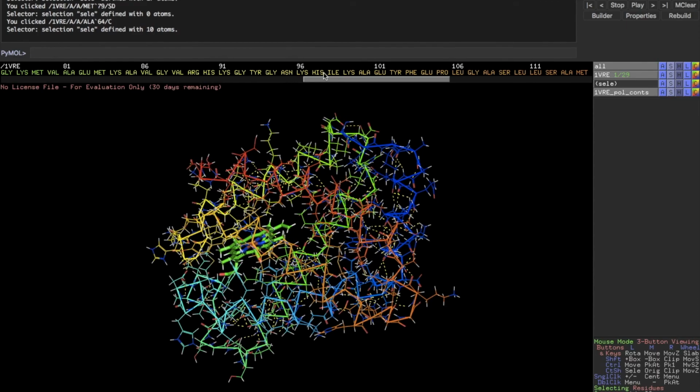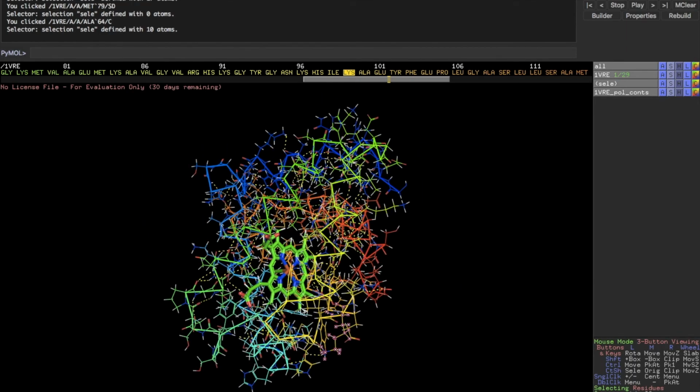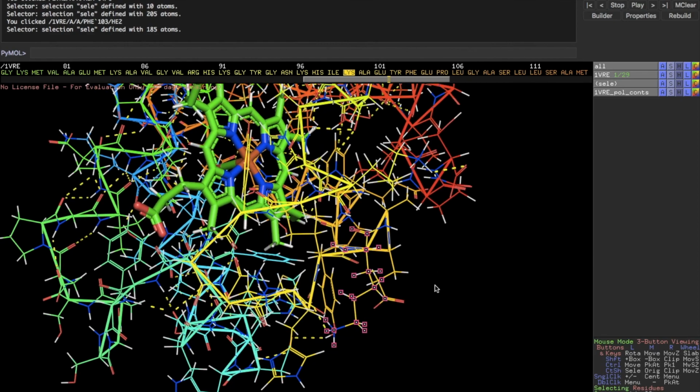Maybe we should click on a lysine again, so we can observe lysine. Here it is on the side. We can zoom in a little bit. We can see that every atom in lysine is now not showing other than the connection of two lines.